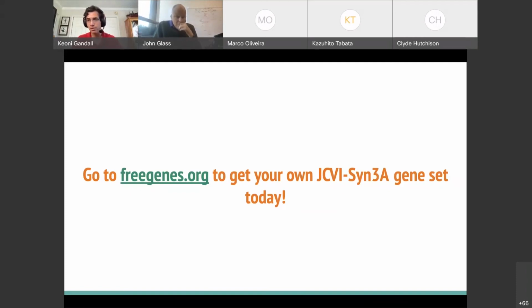And we found a dependence on size. The average gene that we found in these tool sets, or these gene sets, was about 1.3 kilobases, and the average size of a failed gene was about 2.2. So it kind of infers to me, at least, there was something going wrong in their oligo pool assemblies. Seeing that like GenScript's oligo pools are only like 99.7% coverage of all the oligos.